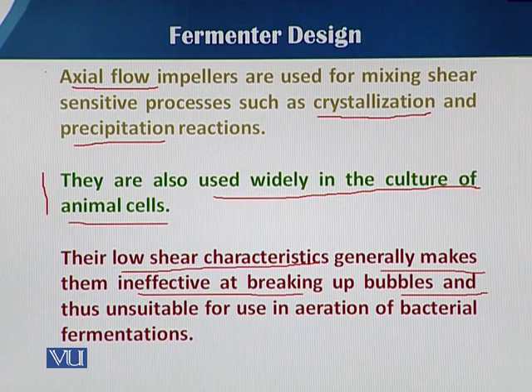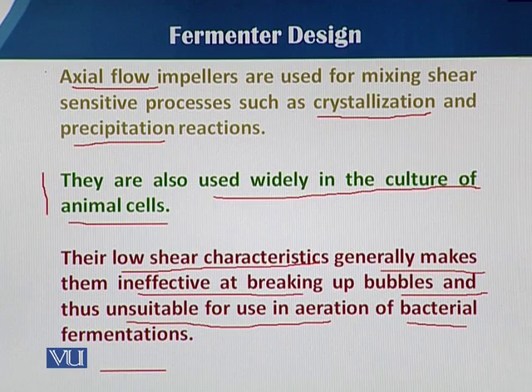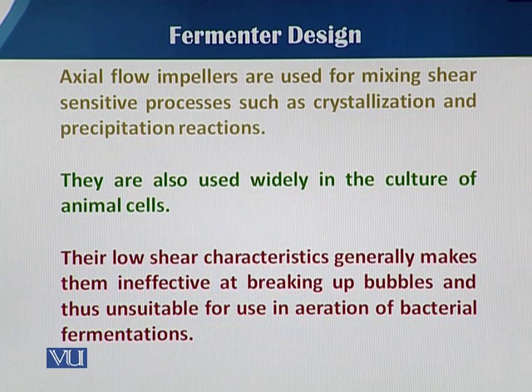As I already told you, axial flow impellers do not have as much shear effect as radial flow. That's why they are unsuitable for bacterial fermentations where more aerobic conditions are required, and are not recommended for bacterial fermentations.